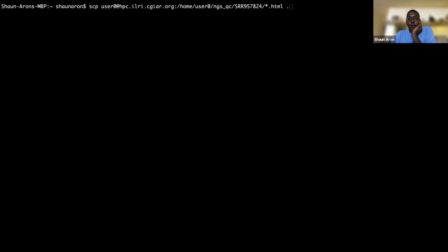What was the other question? Yeah, so I'm definitely, if you wanted to, you can set up the tools on your Linux machine. Just go to the fastqc web page, download fastqc, and you can set it up on your machine. I think fastqc is actually available via the repository, depending on what flavor of Linux you're running. I know it's available on Ubuntu. So if you use a package manager, you can actually just install it with a package manager.